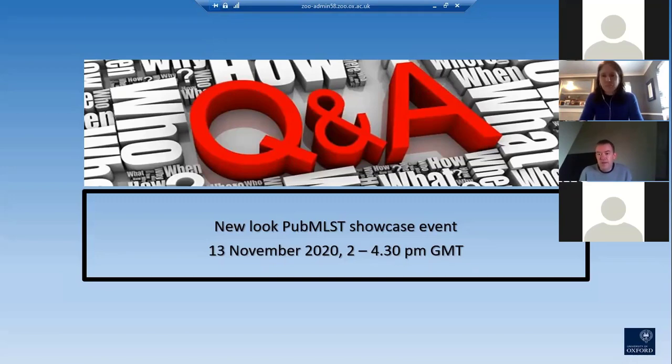So then a curator will either assign them, or if they're easy to assign, like a core genome MLST allele is usually fairly easy to assign if it's got start and stop codon in the right place and everything, then that can be assigned automatically. But yeah, that's all automated, and we have links now from Enterobase of automatically submitting new data directly into PubMLST through the API, and a few others have begun to do that.